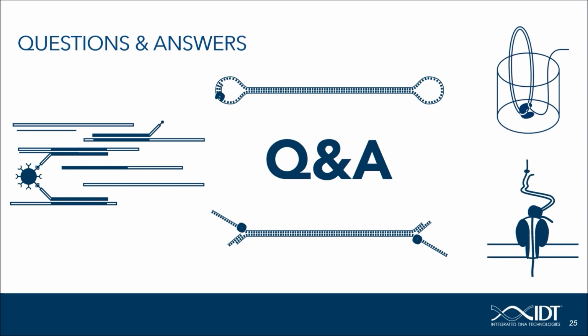Second, we needed to optimize the tiling of the probes and ended up with a 0.5x tiling. This means that 50% of our target bases are actually covered by the probes. As these probes are 120 base pairs in length, the first 120 base pairs are covered with a probe, the next 120 base pairs are not covered, and the next 120 base pairs are covered again with probes. And lastly, we also needed some optimization with regards to the flanks.